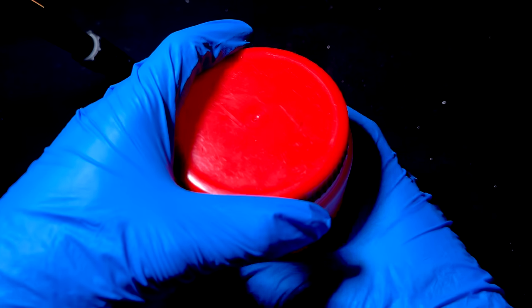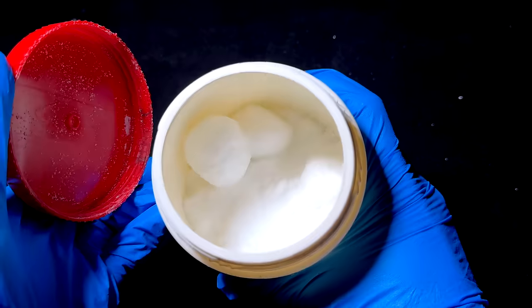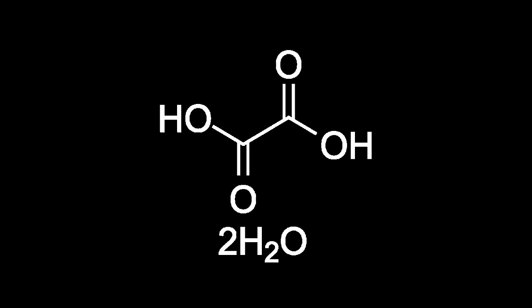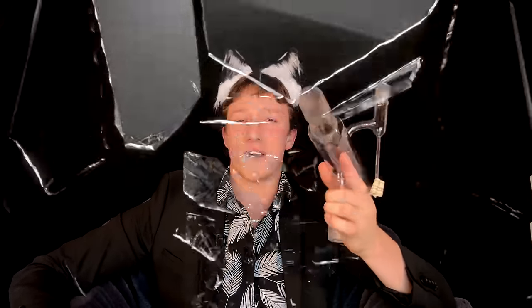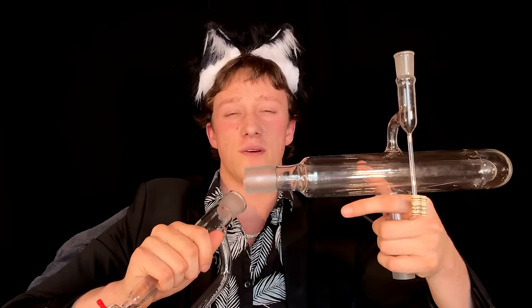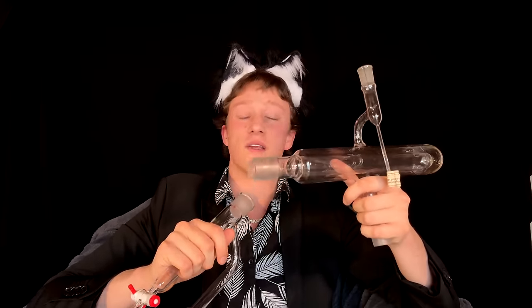There is another part of the preparation that is not directly related to the phenol and for that I need anhydrous oxalic acid. But I only have the dihydrate, so we need to dry it. For drying you could use a water trap and reflux with toluene, but there's a much better method. This is a drying pistol. You put your oxalic acid in here, let steam pass through here and connect another flask with a drying agent over here. This way you can obtain anhydrous oxalic acid without having to remove toluene afterwards.